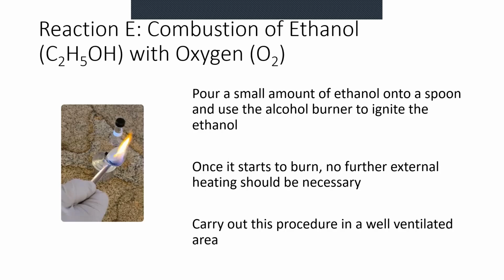Once the ethanol starts to burn, you don't need any further external heating, so you can move the spoon away from the alcohol burner and watch what happens to the ethanol during the reaction. And because you are heating this one, again, we're going to carry out this procedure in a well-ventilated area.